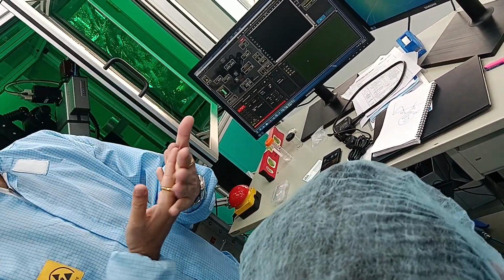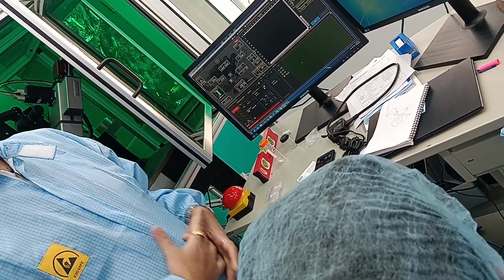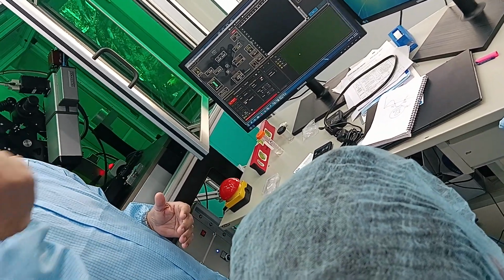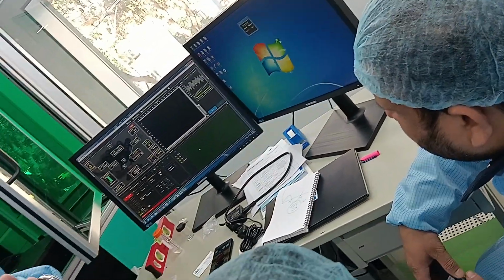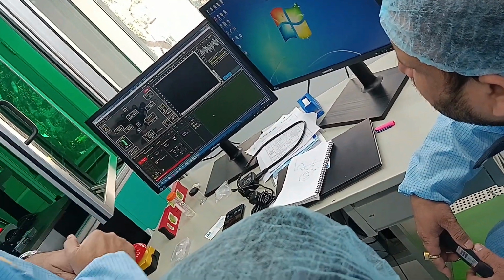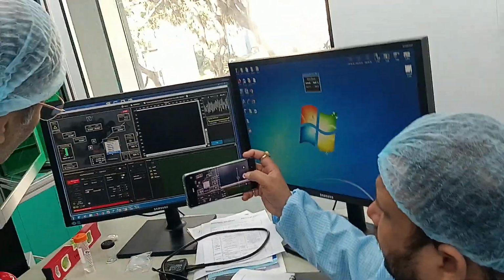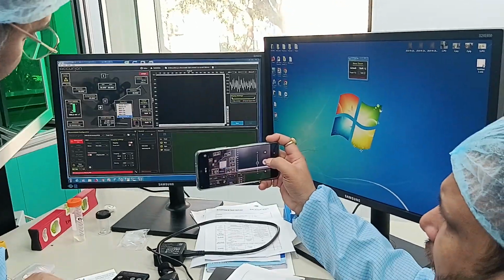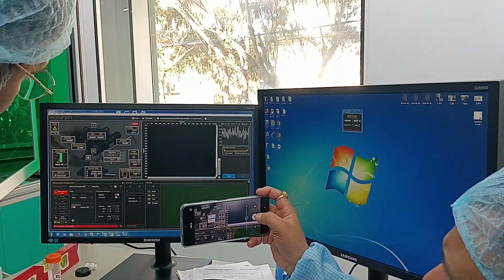For example, a diamond sample, or you have a mica or sapphire. These are all anisotropic, and you can tell in pixel size what the change in refractive index is in X, Y, Z. Okay. From here we have several objectives. One is the nanochromat, which I said is the UV objective. I am not using it now. I can use 50x, 20x, now 10x.